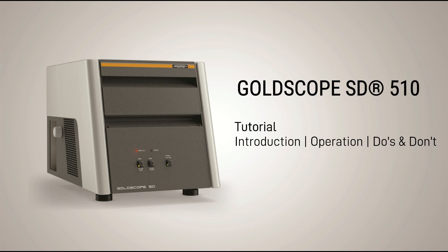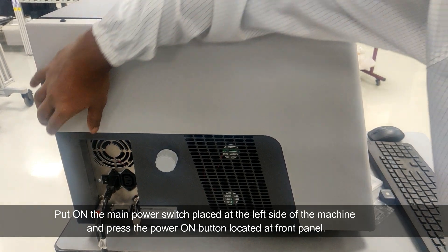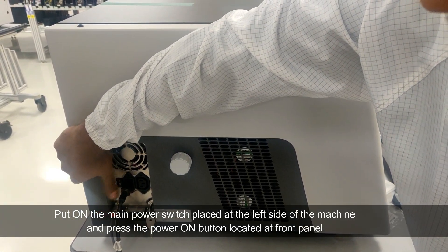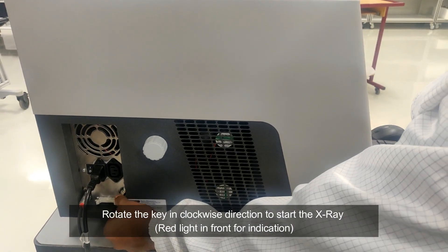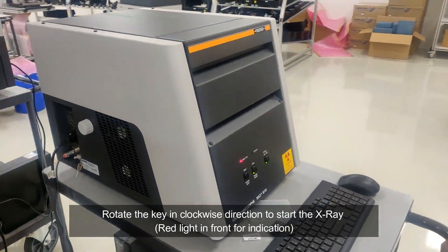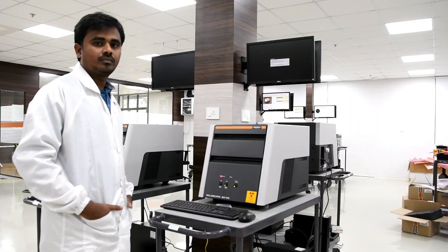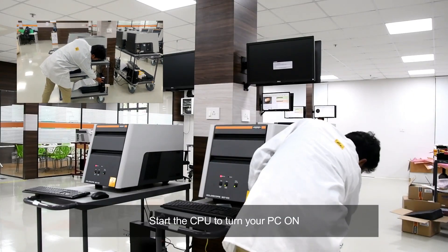Let's start with our tutorial for working of the Goldscope SD510, starting with switching the machine on. Put on the main power switch placed at the left side of the machine and press the power on button located at the front panel. Rotate the key in a clockwise direction to start the X-ray. Start the CPU to turn your PC on.